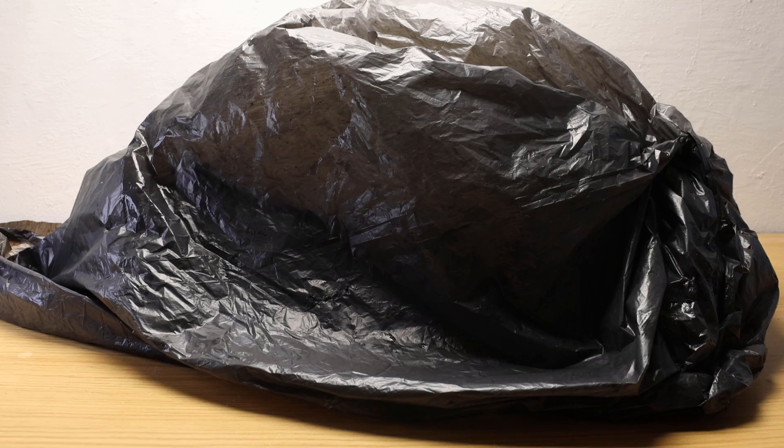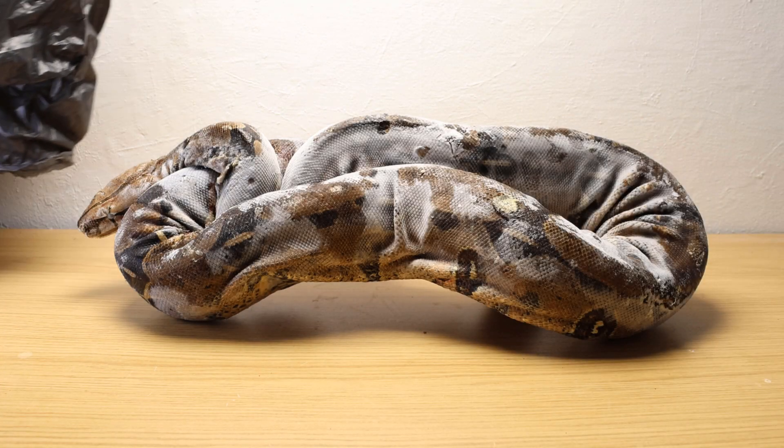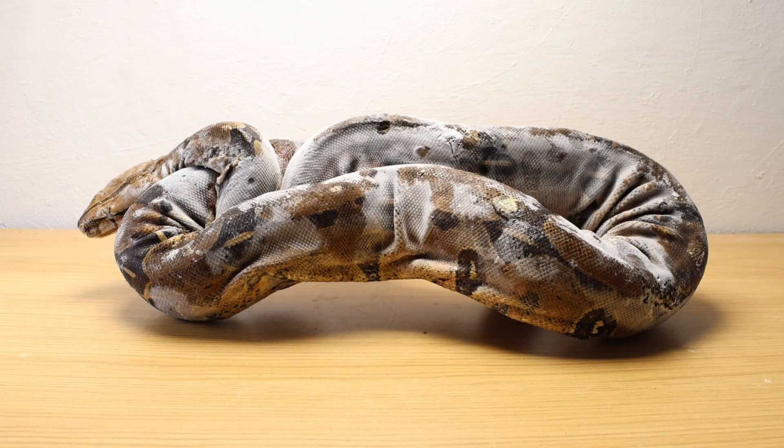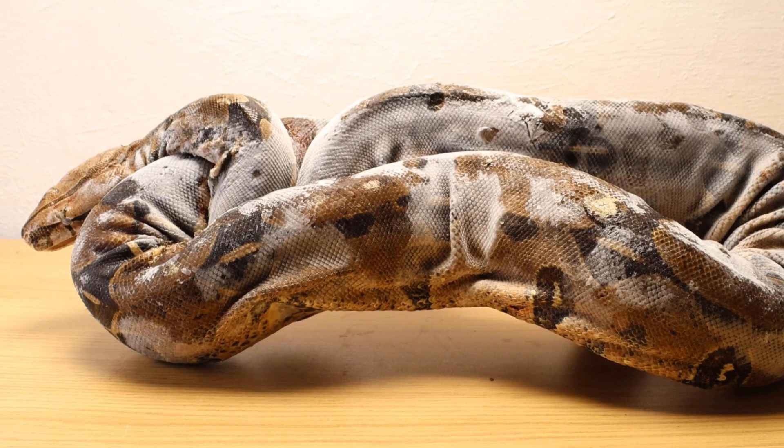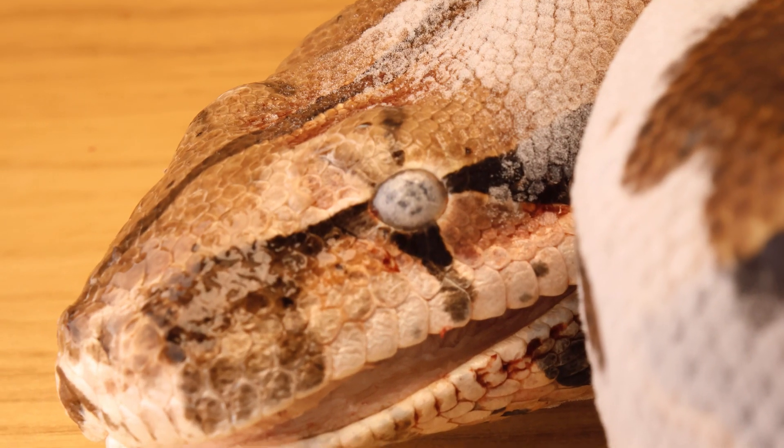Other channels do unboxings, but here at Curiosities of Natural History we take dead snakes out of bin bags. I'm sure there's probably loads of ways to do it, but this is an example of my no-rush, no-smell method of preparing a specimen to be skeletonised by dermestid beetles.